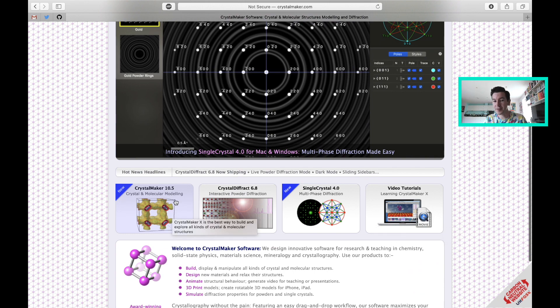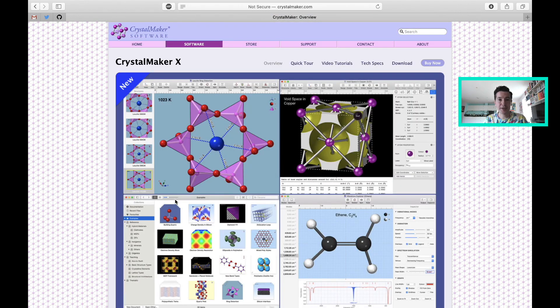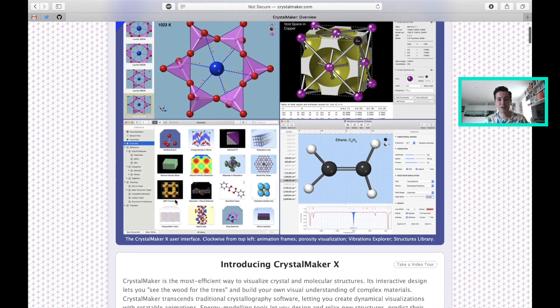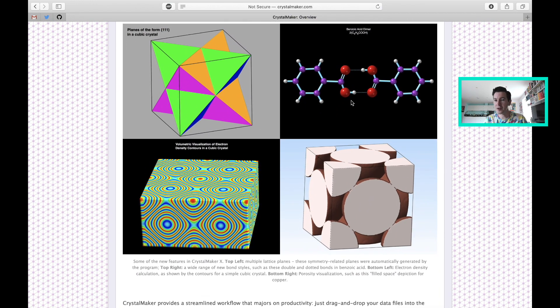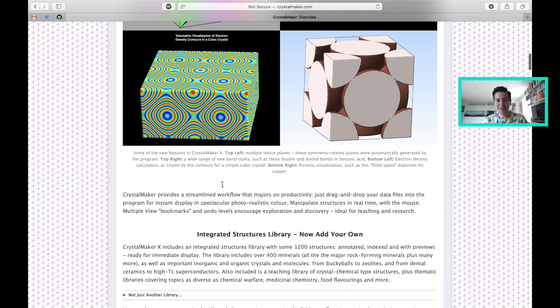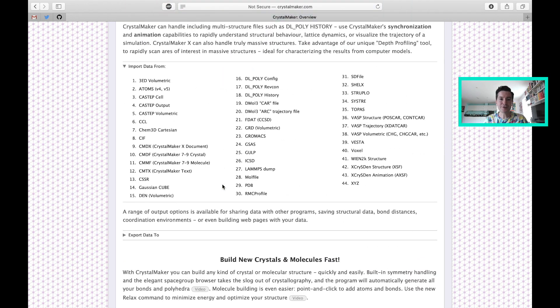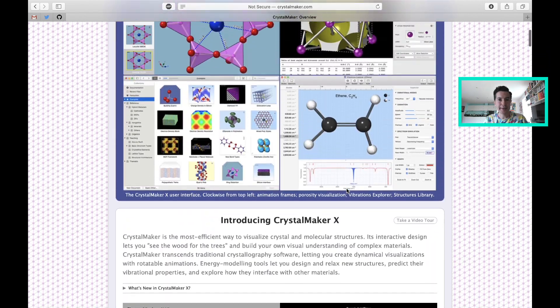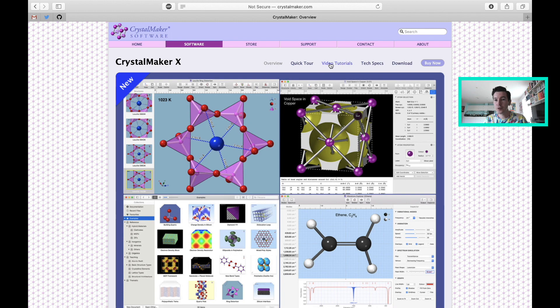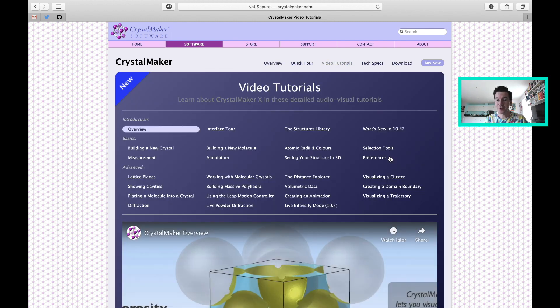Today we're going to focus just on the visualization side. When I click on CrystalMaker, the front page tells you about all of the things it can do — many different types of fancy visualization to look at atoms, to look at the electron density associated with crystals, reading inputs from many different other packages, and the ability to modify structures. There's also a range of video tutorials for different tasks, such as creating a domain boundary or showing lattice planes, which may be useful when you get comfortable using the package.